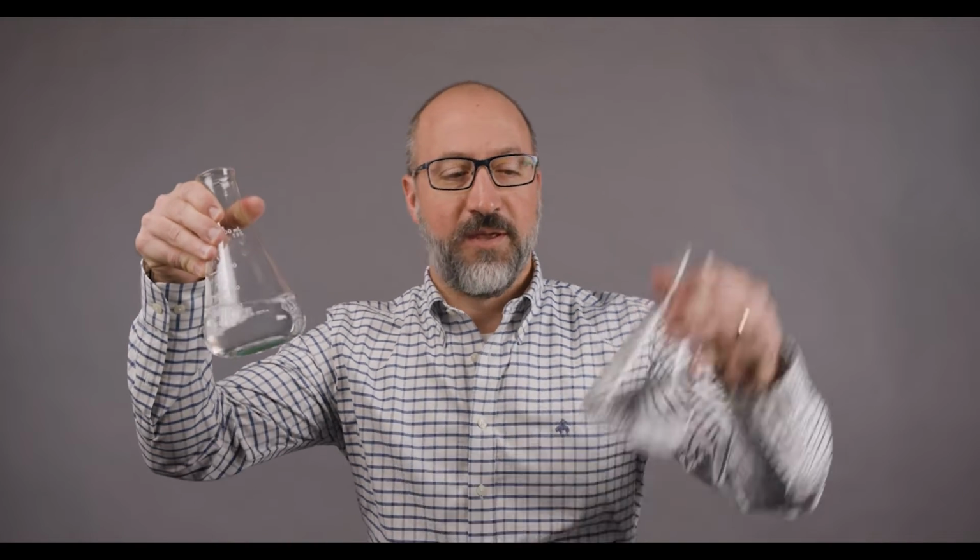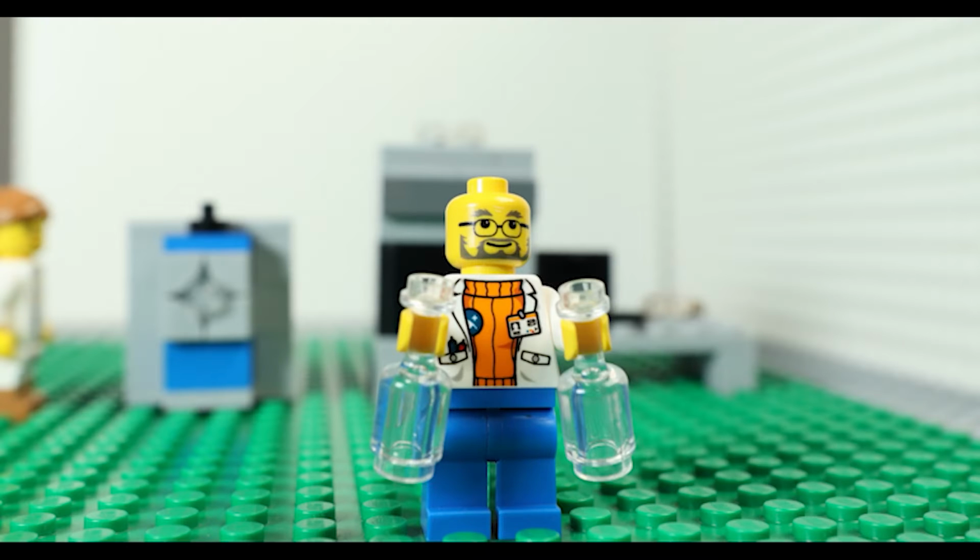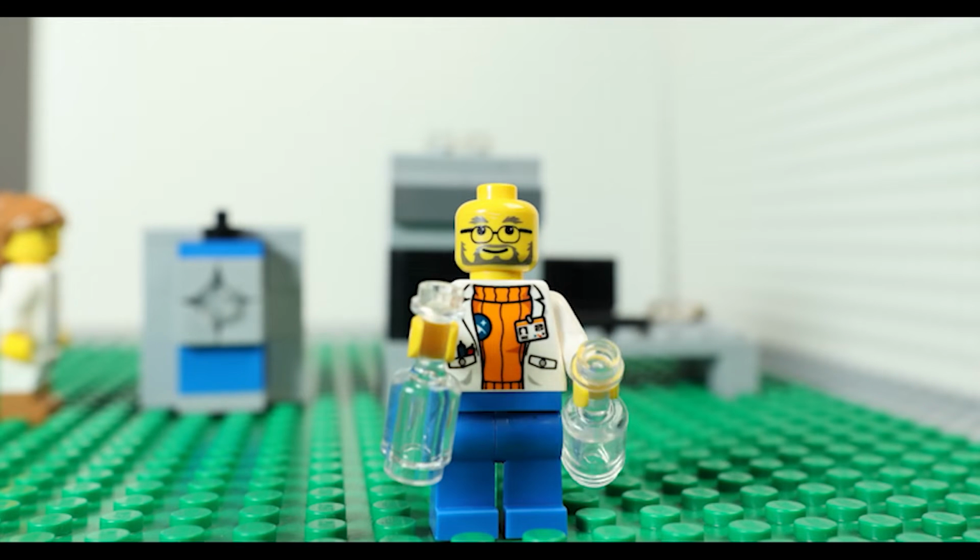Ultrapure water and water containing PFAS both look identical to the naked eye. There are no visual or optical clues that tell the presence of PFAS in water. So we have to use other methods to identify them.